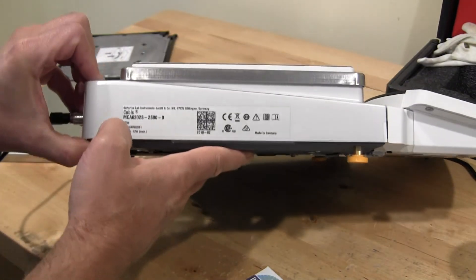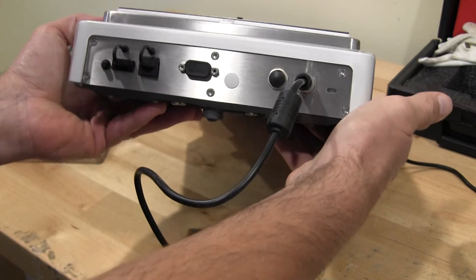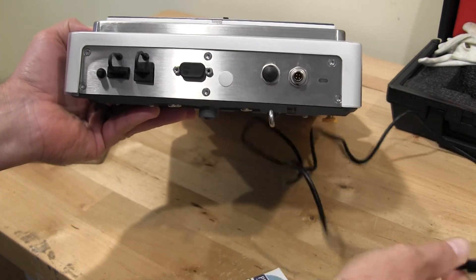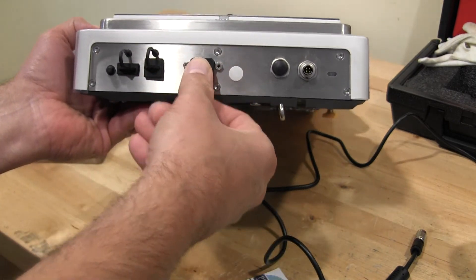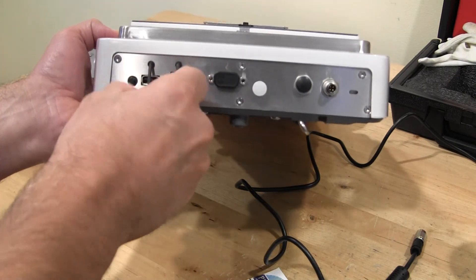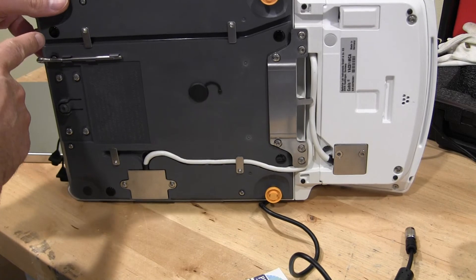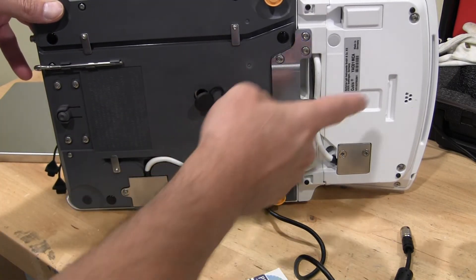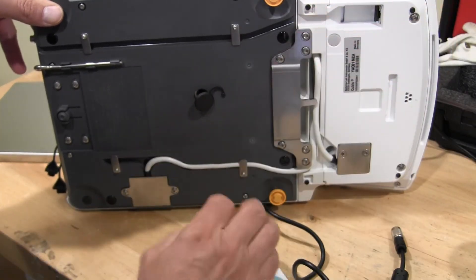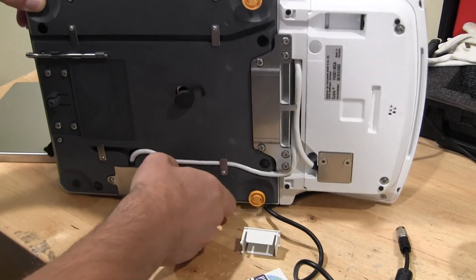The side of the balance denotes the model number and serial number. The rear of the balance has the power connection — it's like a military-grade connection. You have your RS-232 serial DB9, USB, and another USB port. The bottom of the balance has an underhook port. The display can be removed if you'd like — you undo the screws and you can see the cable in there. This balance also has an ethernet connection, and this particular model has the motorized internal calibration.